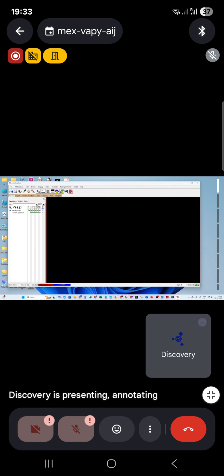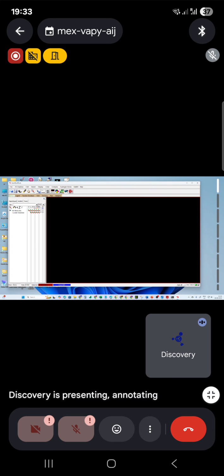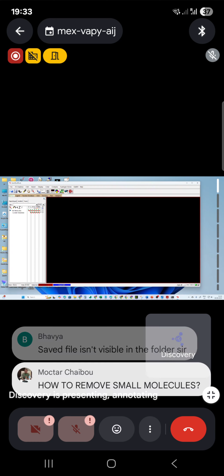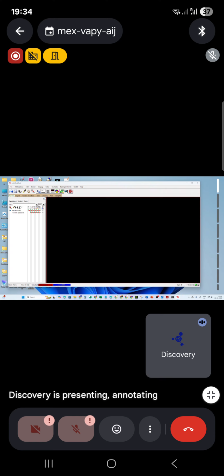Mantiram, again, I'll tell you what you need to keep and what you need to remove. You need to properly do research or a background study of your target protein. If your target protein has a cofactor or a metal ion, then you need those.